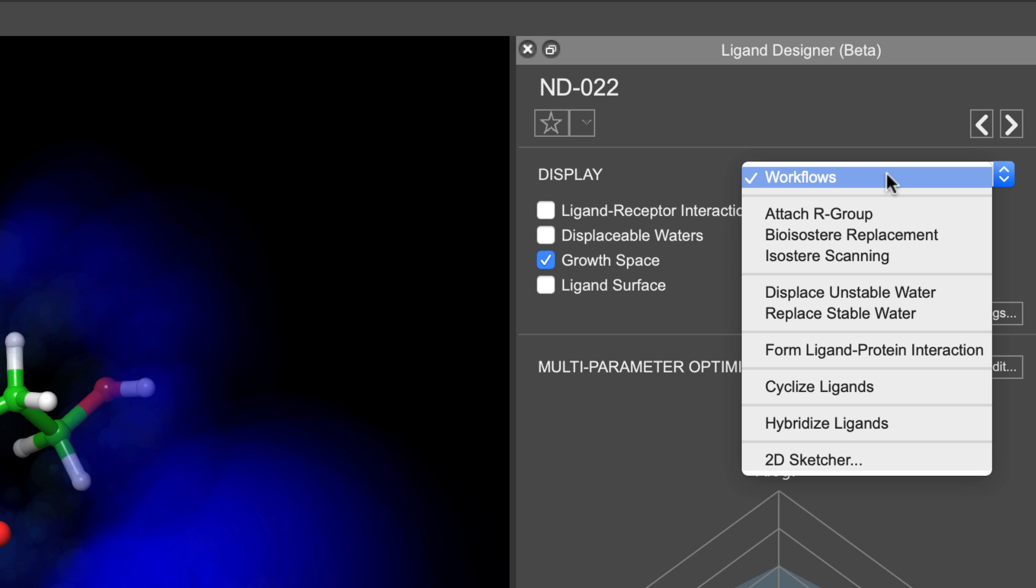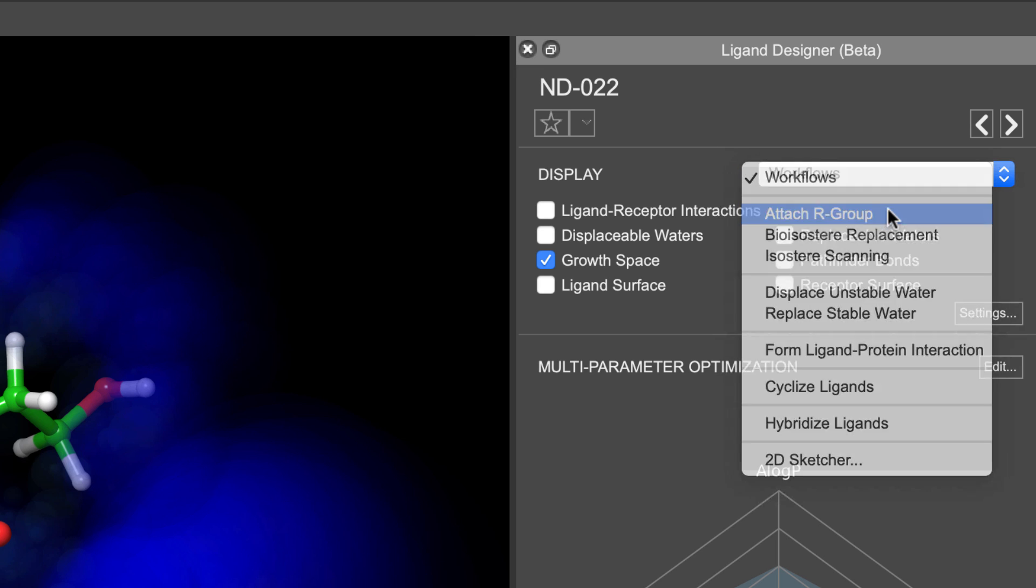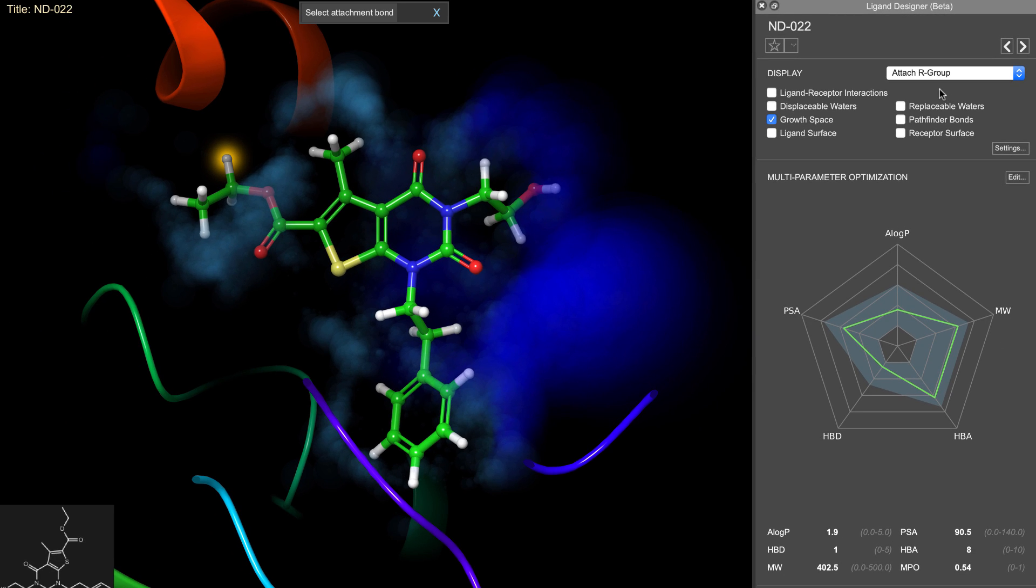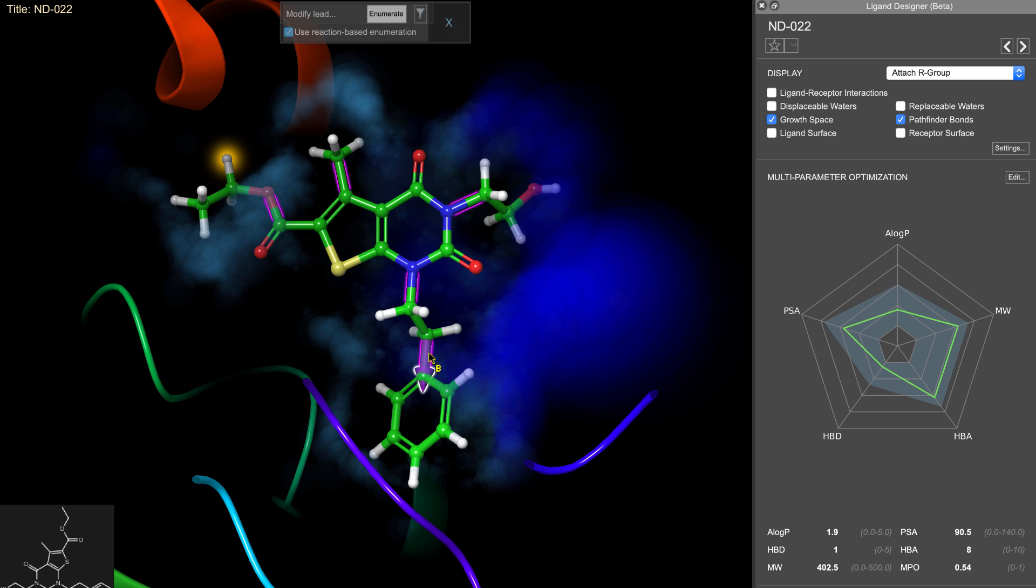Additional workflows can be found in the workflow option menu. The Attach R group workflow performs R group enumeration at a bond that you choose. It's useful to display Pathfinder bonds for this workflow, so you can enumerate at a location that can be substituted in a known synthetic route using the reaction enumeration method.